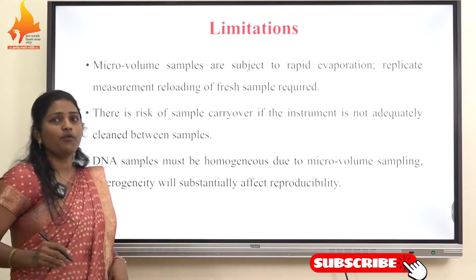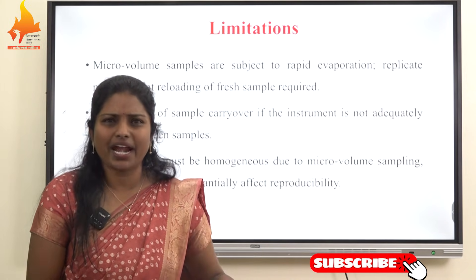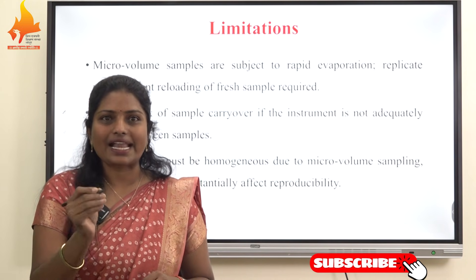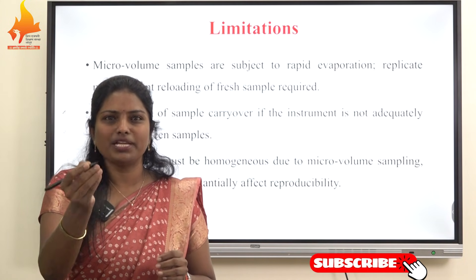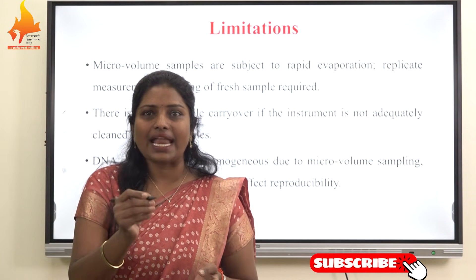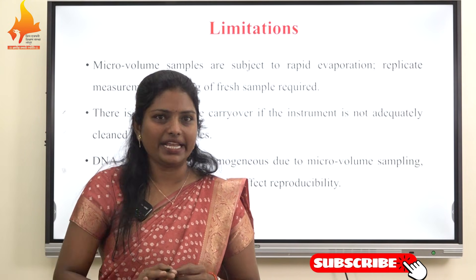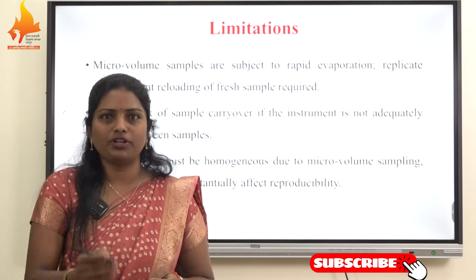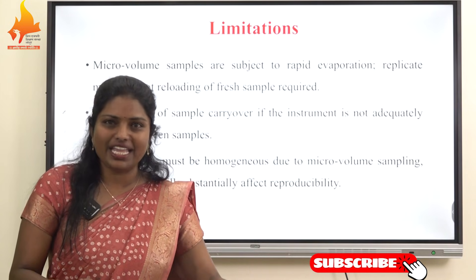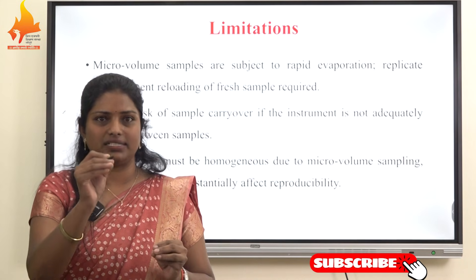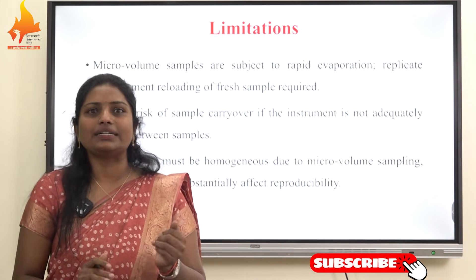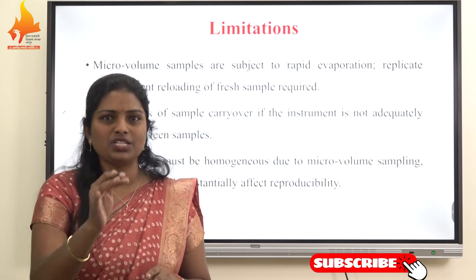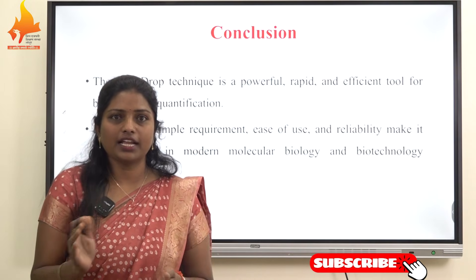Despite its many advantages, the nanodrop technique has certain limitations. Since it uses micro-volume samples, there is a risk of rapid evaporation which may affect accuracy if measurement is delayed. Improper cleaning of the pedestal can lead to sample carry-over, affecting subsequent readings. The nanodrop also has lower sensitivity compared to fluorimeter methods, especially for very low concentration samples. It cannot differentiate between DNA and RNA in a mixed sample, as both absorb at 260 nm. Additionally, the technique is not suitable for highly turbid or heterogeneous samples, which can interfere with absorbance measurements.